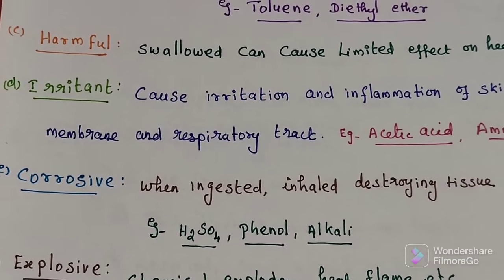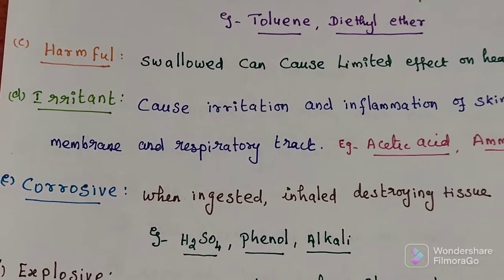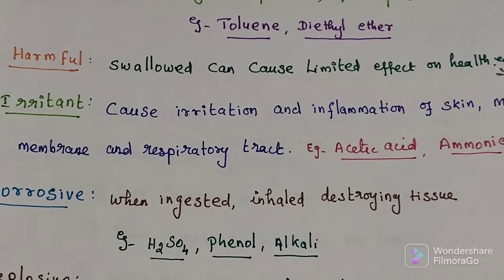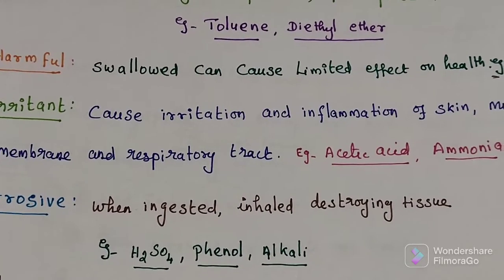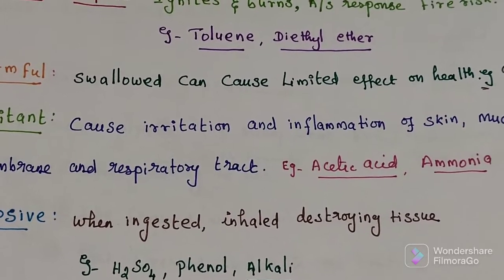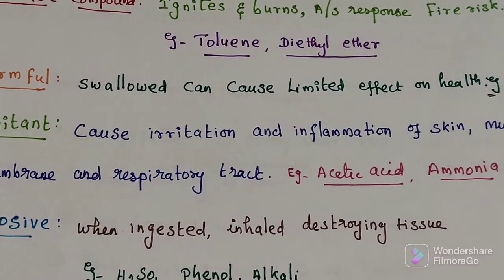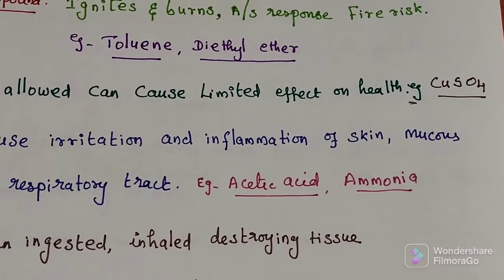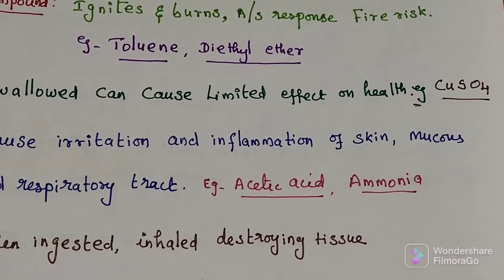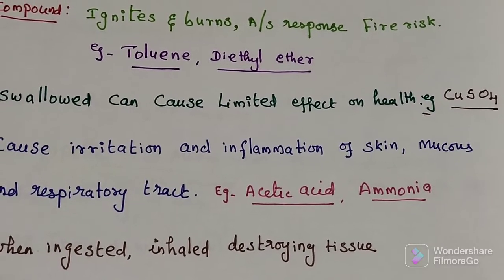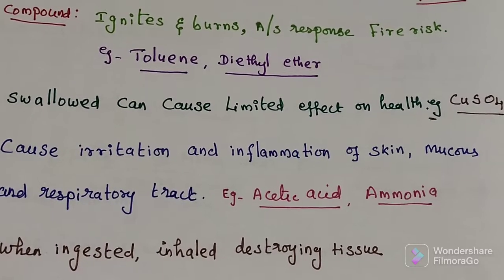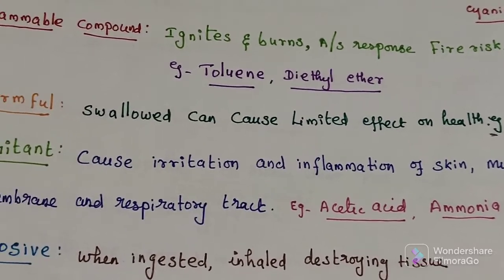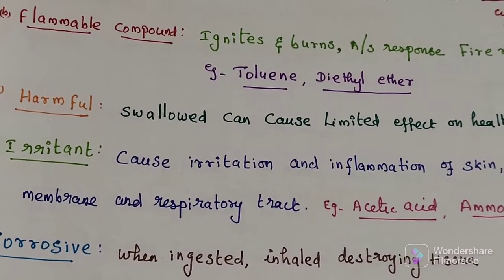The third type is harmful chemicals. A chemical that when swallowed can cause a limited effect on health. When inhaled or absorbed through the skin, it causes harmful effects. Example: copper sulfate.